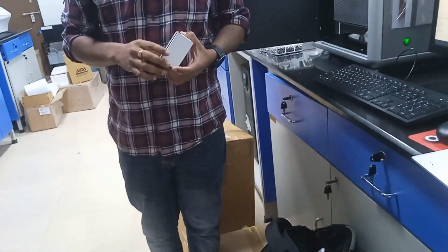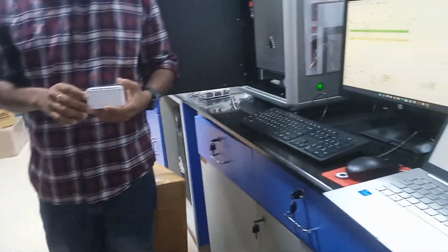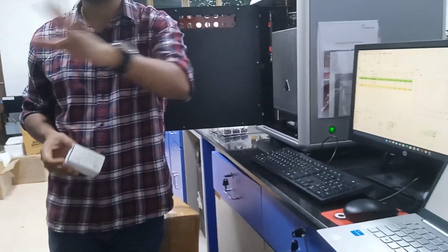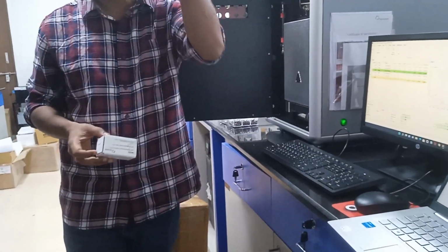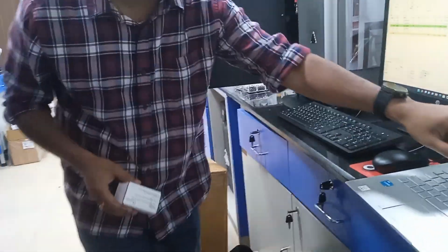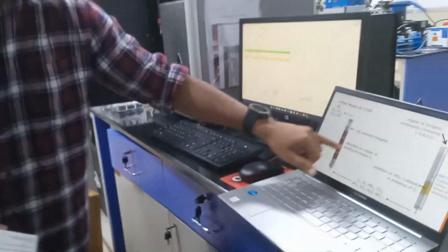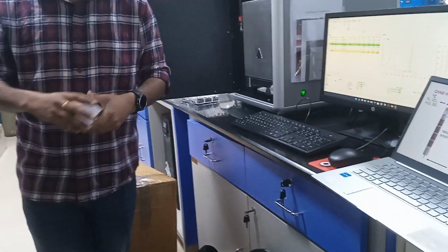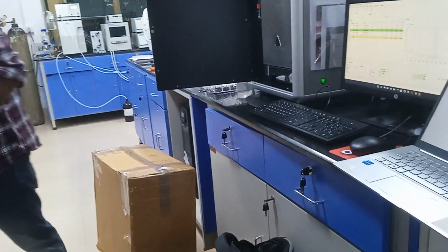How much for the silver wool? All you have is more than enough. It will last for another two fillings. These are mostly used, and this and this you have to buy bottle-wise after every 1,000 usage.